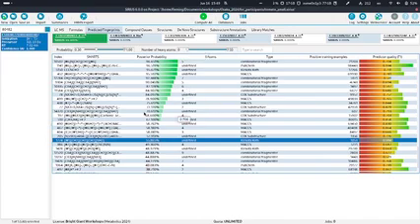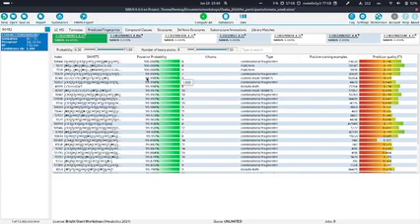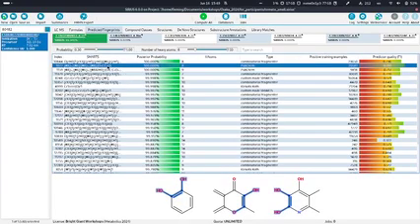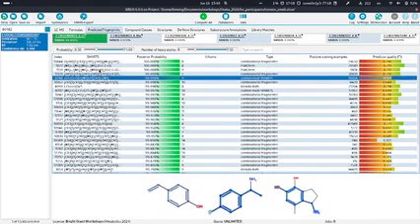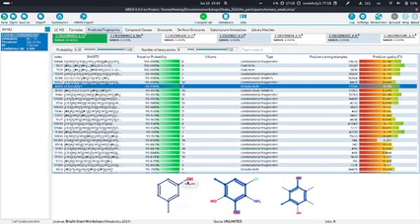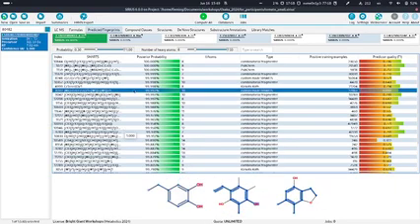So often you get some substructures which are not really that interesting. For example, two carbon atoms is not really something very useful. But if we say, for example, we want at least 6 heavy atoms, and we now click on some of these structures, you will see in the bottom examples of how these substructures look. And okay, so it looks like we expect something like this for our structure.